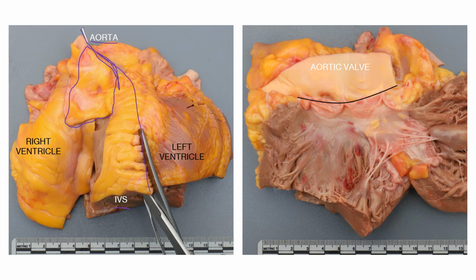So we're going to make a curve out into the aorta. And this is one, until you become very, very comfortable, I would always probe your pathway. And what that exposes, of course, is our aortic valve. Again, want to measure the distance, make gross notes. Looks like there's some mild atherosclerotic or calcific change. And why we do it this way is we have our anterior mitral valve leaflet intact, and we can flop this heart back together if needed, and everything should stay nicely put back together.